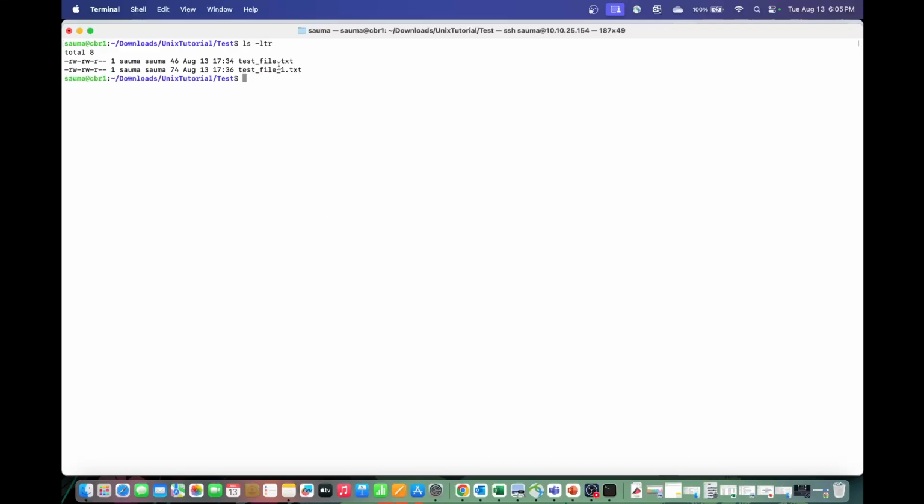So for example, in this file, I want to see if there is a 2 inside the file or not, the element 2. So what I'll do is a grep like this. Then a space, the thing that I want to search inside the file, space, the name of the file. See, it gives me highlighted marks. So 2 is present in these elements. If I want to do say a 25, this means that there are two 25s inside the file.